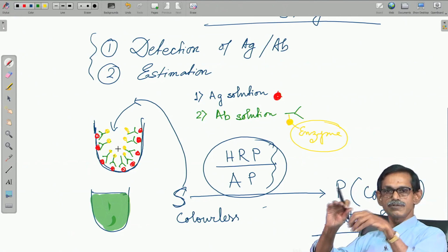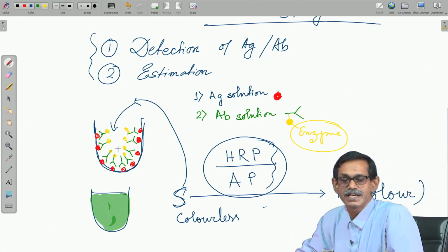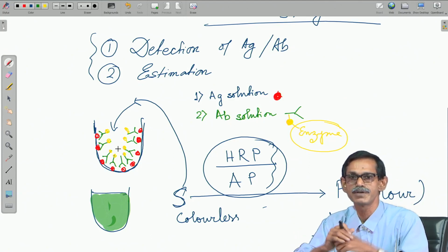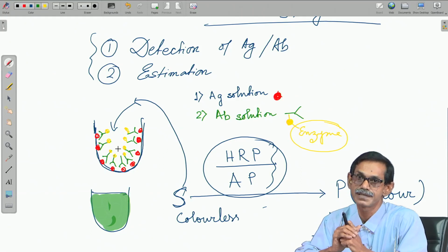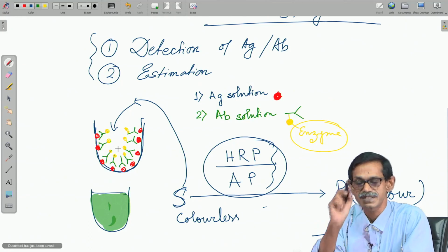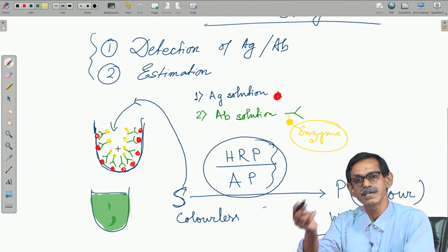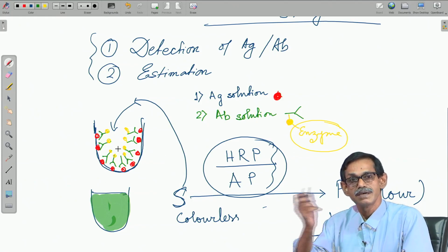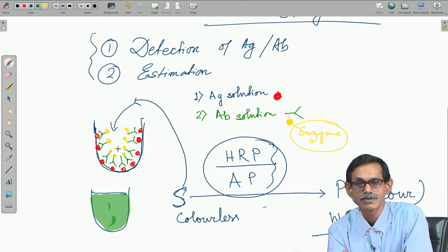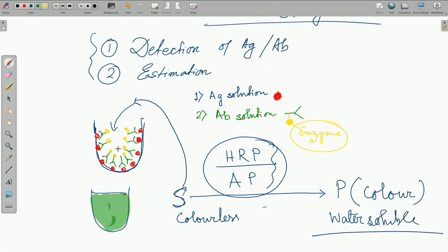So, I take that solution, isolate the bacterial extract and add it. And some of you will say no, this water is completely pure, there is no bacteria, I would like to check. What I can do is take that water, extract the protein, add it. Then repeat the whole thing, and as the antibody I will give anti-typhoid antibody. Clear? So, if this water has the antigen, it will bind, and then your antibody will bind, and at the end I will see the color.